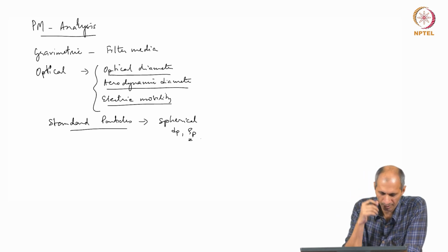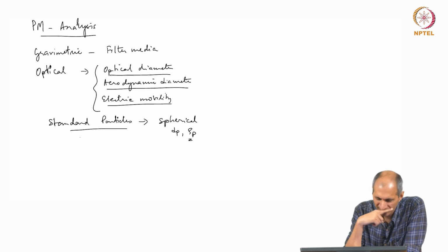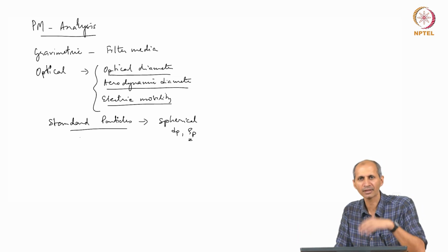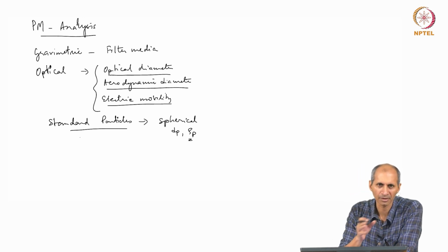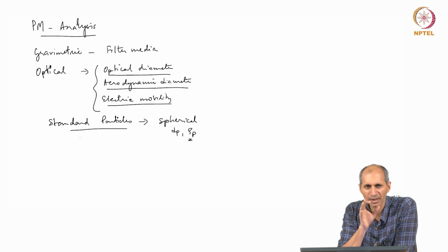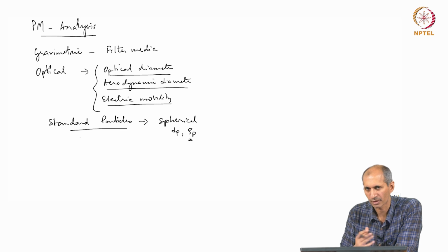So, you calibrate the instrument using standard particles like this, and then you do the same thing with other instruments and see what it is giving. So, whatever this says as 10, what is that other instrument saying. So, you make a correlation like this. The simplest way is to get these three instruments and run them at the same location if you do not have a standard, and then compare the particle size distribution or the numbers that you are getting in what is supposed to be PM10, one instrument is giving, the other instrument is giving PM10. How does it vary? There will be a difference, and this is usual, that is normal. So, you have to use this data carefully. You can't just blindly use one classification for the other. Okay.